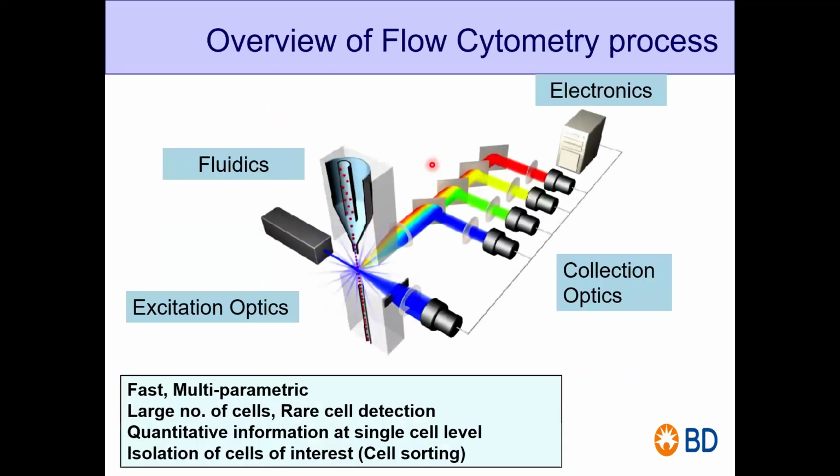So this is just an overview of how the flow cytometer works. I really want you to keep this overview in your mind, so it will be very helpful when I'm talking about more things in the next slides. This is like the path of the light. This is your interrogation point. What does interrogation point mean? It is where your cell hits the laser and releases the photons. The point where your cell hits the laser, we call the interrogation point.